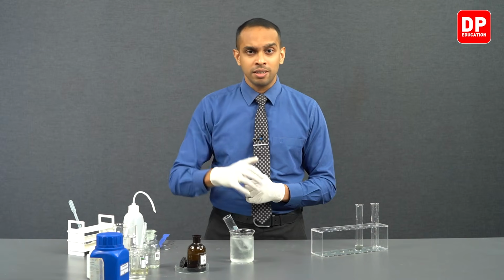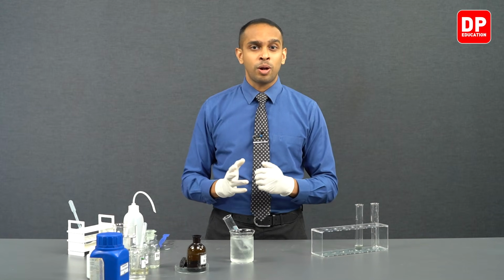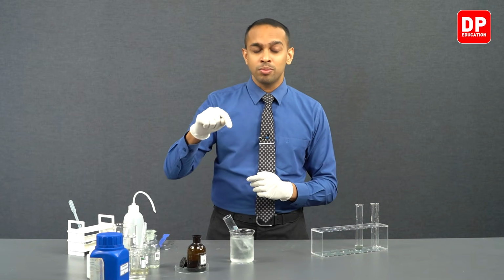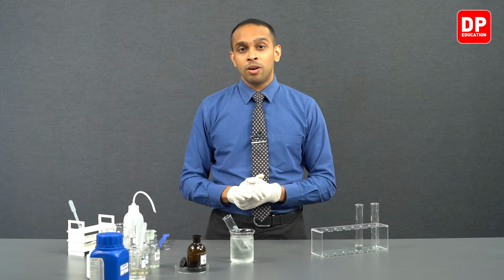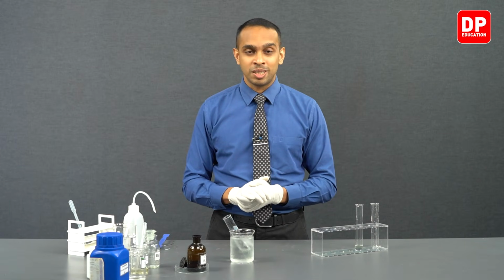And if you shake the boiling tube while you add the sulfuric acid, you will not observe the formation of this brown color ring. The top layer will completely turn brown instead of forming a nice brown colored ring at the interface of sulfuric acid and the Fe2+ and nitrate ion solution mixture.